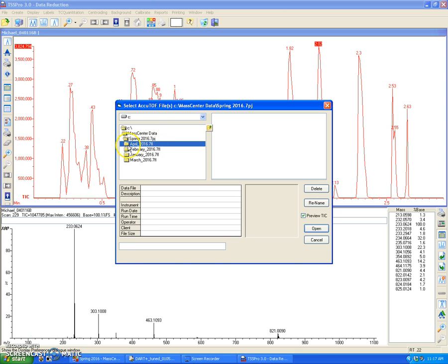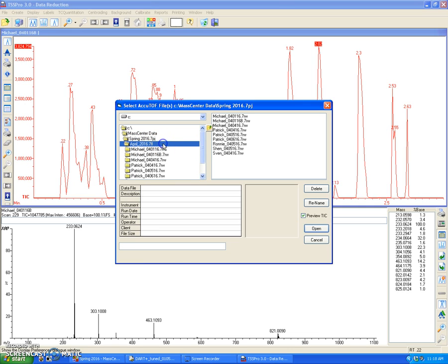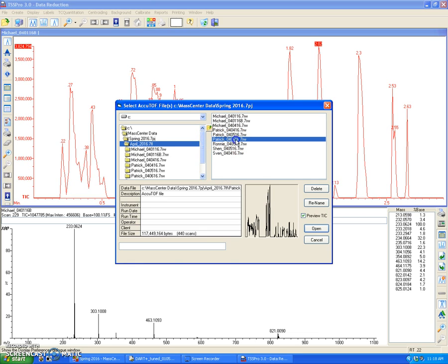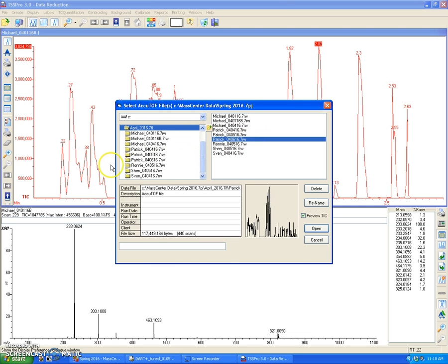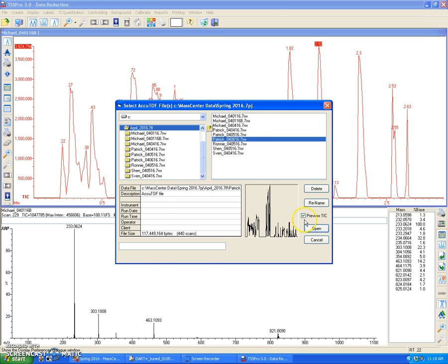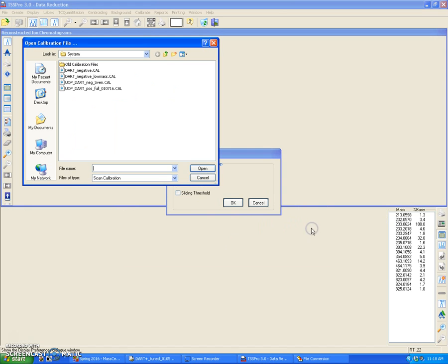So in this case, my data file was saved in April underscore 2016. I'm going to double click on that. And my file is Patrick underscore 040616. You're going to see or notice that these files are also within these folders right here. You can ignore these because the data file to open is in this window right here. So I'm just going to select that and click Open.